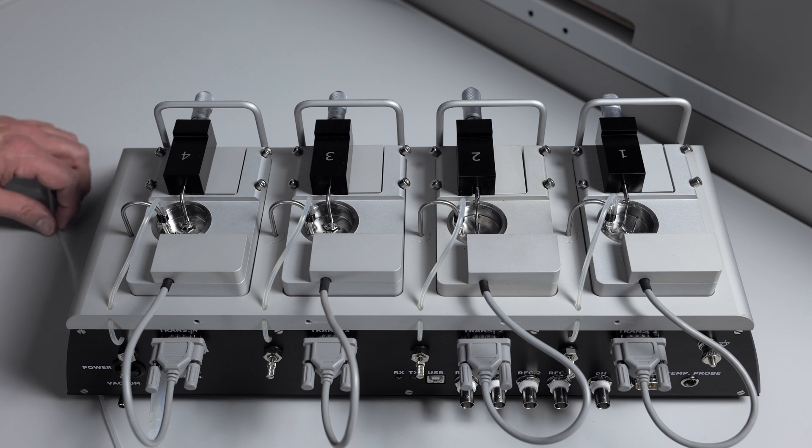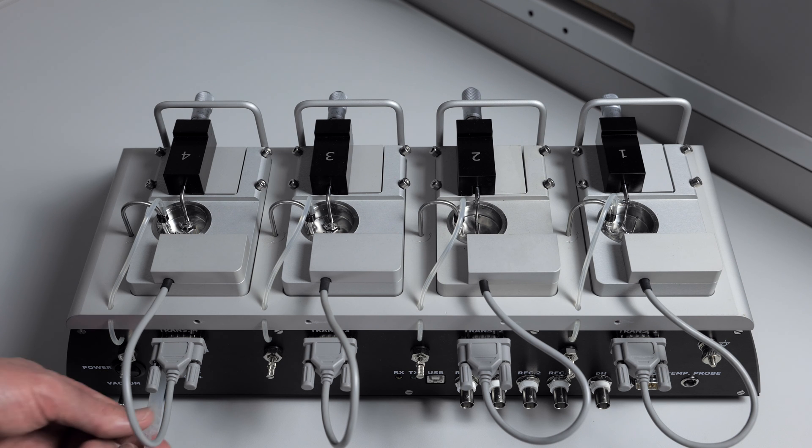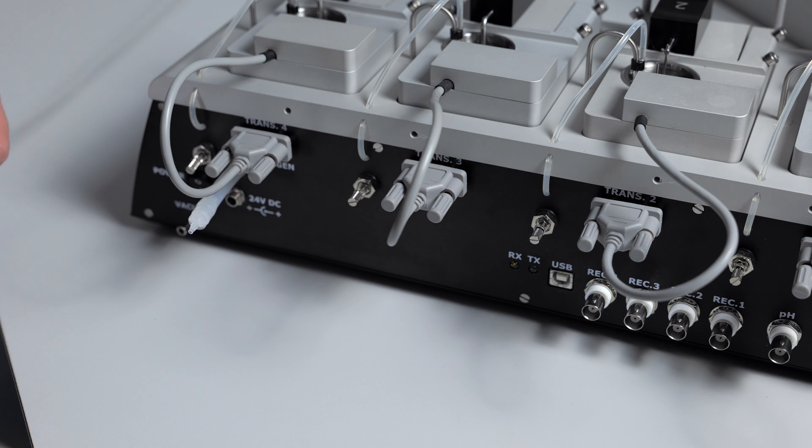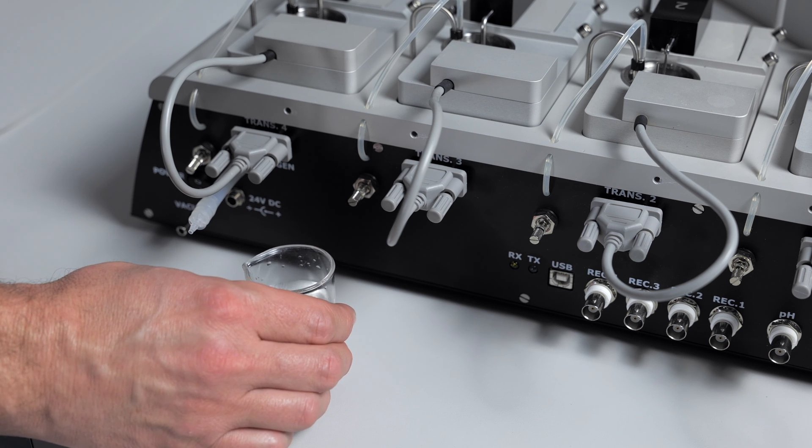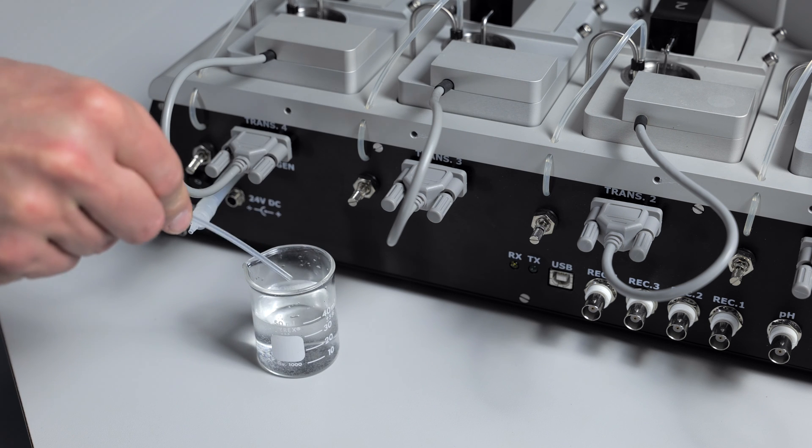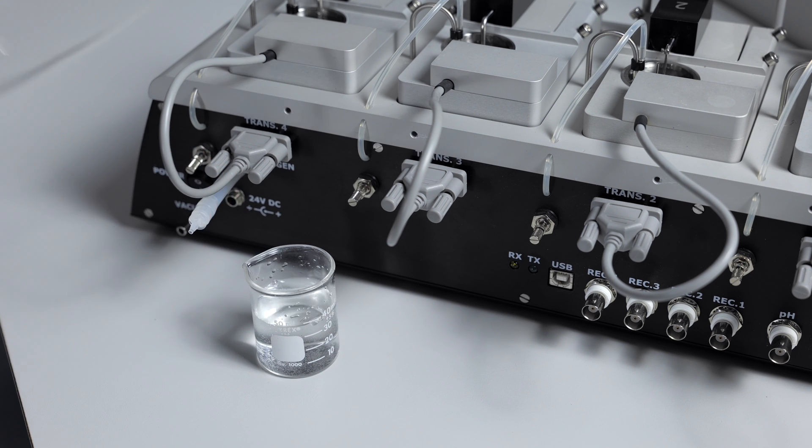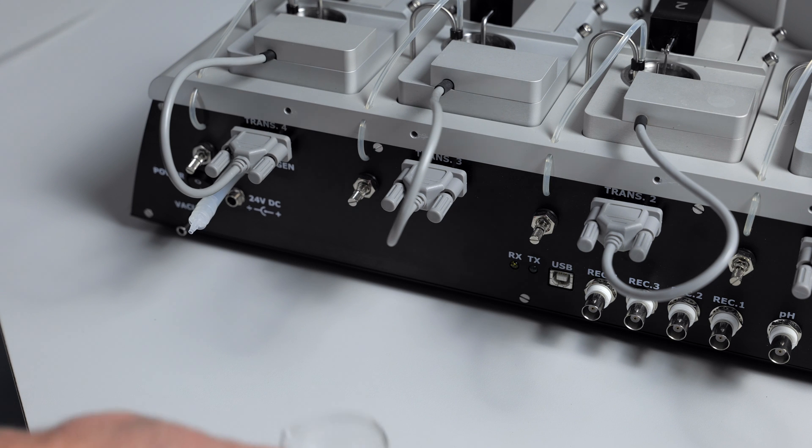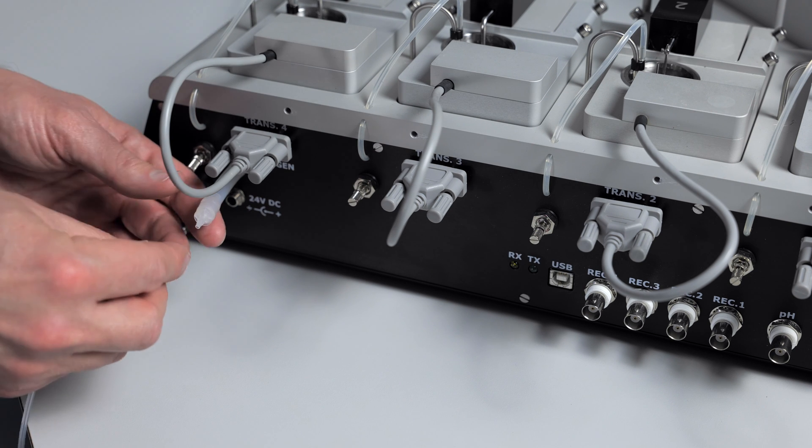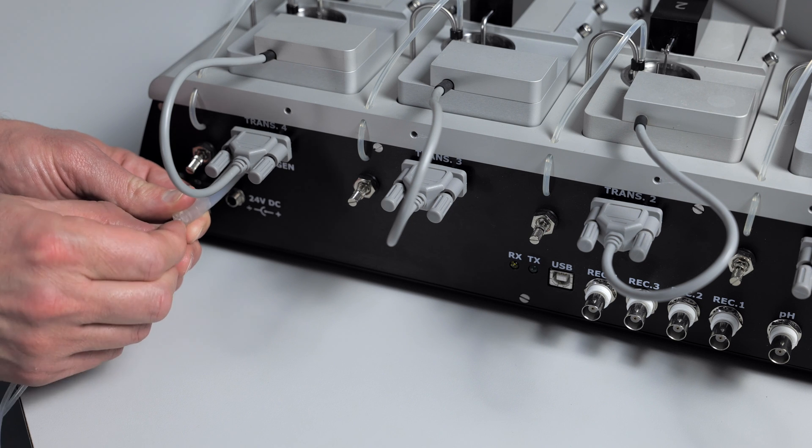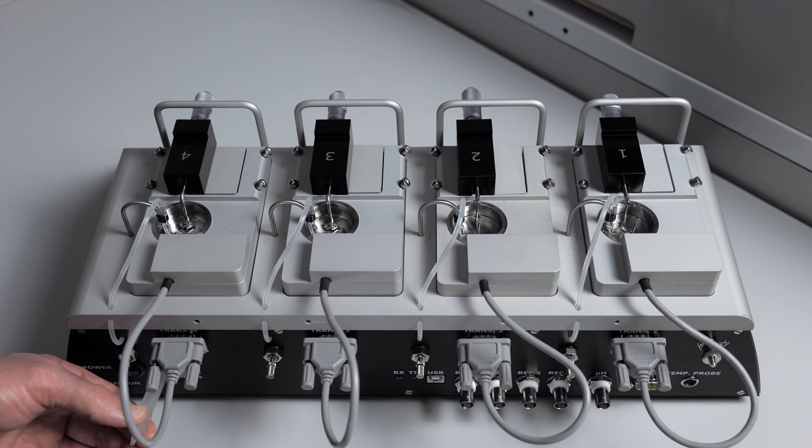To do that, remove the tubing and grab the beaker of water and see if you have bubbling. If you have bubbling in the beaker and no bubbling in your chambers, and all your needle valves are open, then you have a clogged gas line and you'll need to contact your DMT representative for shipping and repair instructions.